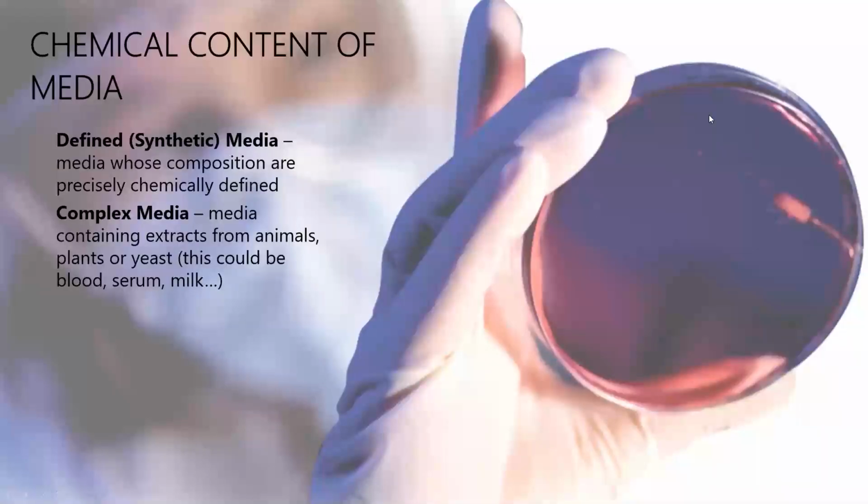Media is what the recipe is. So what's the chemical content of what we're actually putting in with the agar? So we have our seaweed agar part, and then what is the other stuff that we're adding in that the particular bacteria likes or doesn't like? So the two main types that we have is defined or synthetic media and complex media.